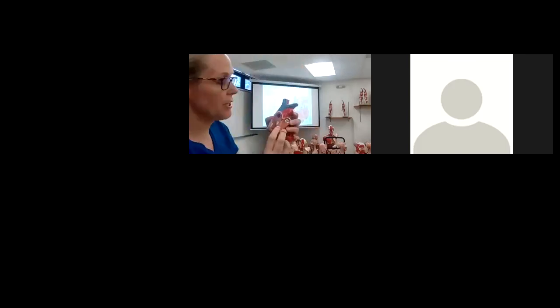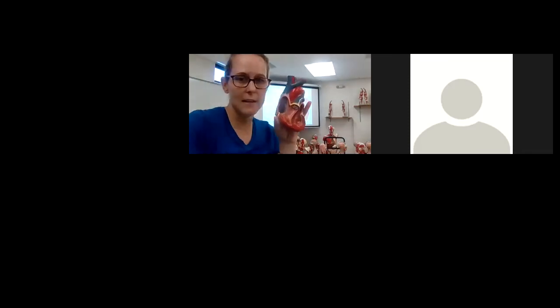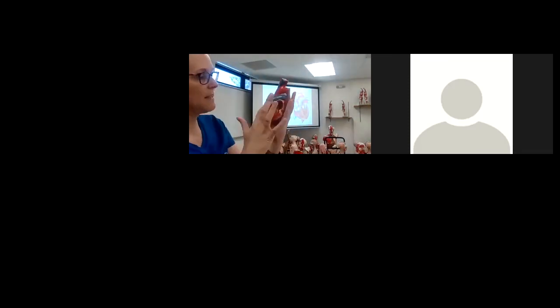Okay? Right. The ventricular septum is going to be this big piece that separates the right and left ventricles. In our human heart, the ventricle is pretty big, but in the sheep heart, it's pretty thick. The big left ventricle is so pushed off to the side that you don't usually see much of the chamber of the right side. Right? And this side is going to make a nice, almost crescent figure.